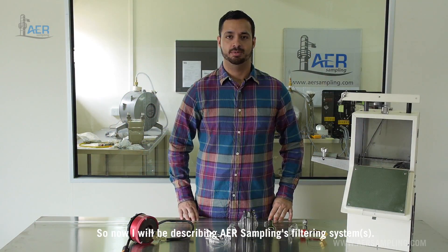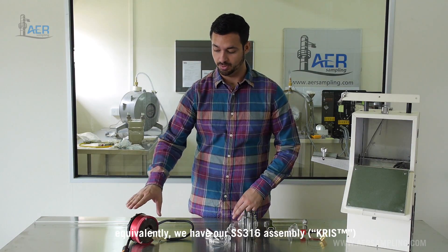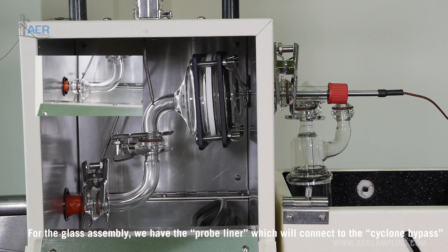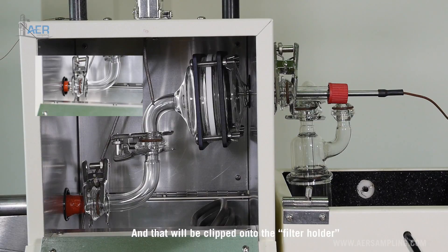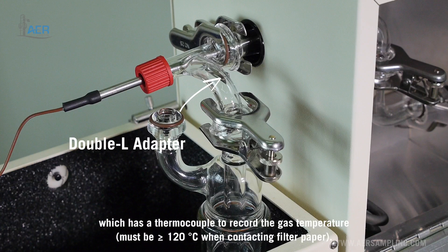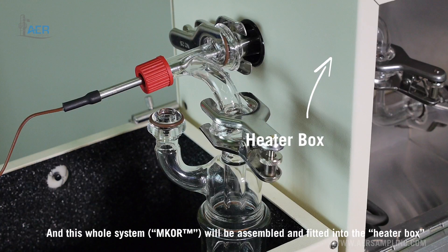Now I will be describing AER sampling's filtering system. Here's our glass assembly, and equivalently we have a stainless steel 316 assembly. For the glass assembly, we have the probe liner which will connect to the cyclone bypass, and that'll be clipped onto the filter holder. Then that will be clipped to the double L adapter which has a thermocouple to record the gas temperature. This whole system will be assembled and fitted into the heater box.